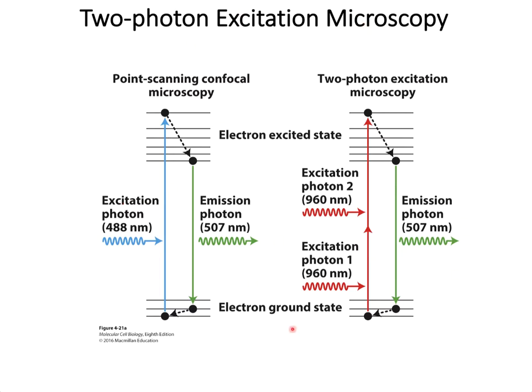In 2-photon excitation microscopy, near infrared wavelengths are used, which have much less energy. Remember that the shorter the wavelength, the higher the energy; the longer the wavelength, the less the energy. Just think that UV in sunlight, of shorter wavelengths, less than 300 nanometer, can cause sunburn, but say blue light, as in the above example of 488 nanometer, will not cause a skin burn.